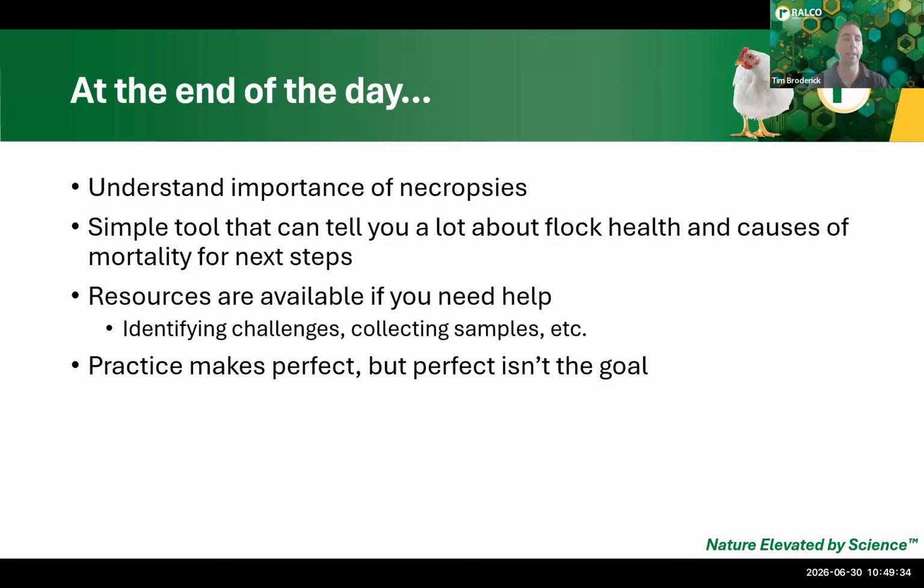It's important to be consistent in monitoring what your flock mortality looks like, what previous flocks have been, documenting and establishing your own procedures. Because even in severe cases where veterinary staff might not be close by, just being able to open up a bird, snap a couple pictures, and send it to them, even if they're still coming out, that 6 hour head start can sometimes get the wheels moving on some of those longer term things, understanding, okay, it's something we're going to need to take specific samples for, and being able to go out and gather those resources while the technician's coming in.